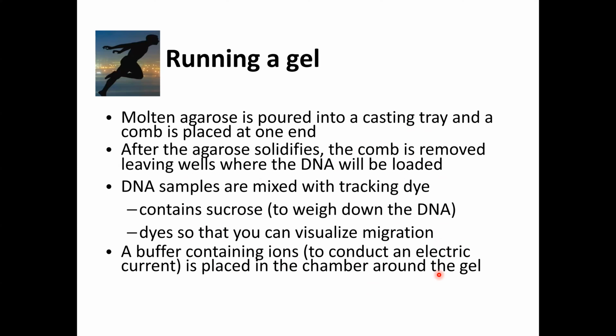Hopefully your laboratory professors were able to give you insights on how to run a gel, or some video that could help you. It's an easy test, but you have to be careful because you're dealing with electricity and electrodes. Also, I have to mention that some of the dyes, especially the tracking dye, are cancerous. The ethidium bromide we use in gel electrophoresis is also cancerous, so be careful to avoid direct contact with the reagents you use in the electrophoresis.